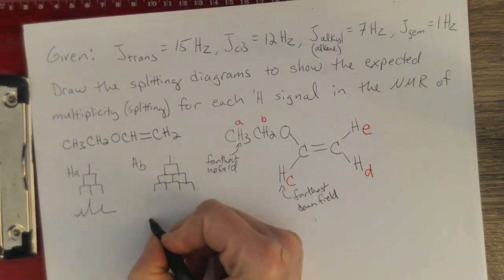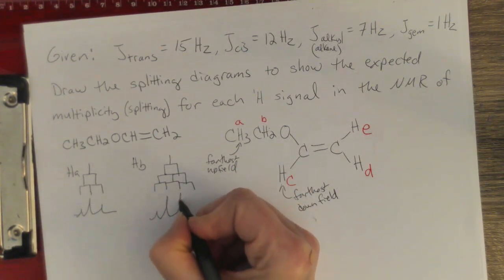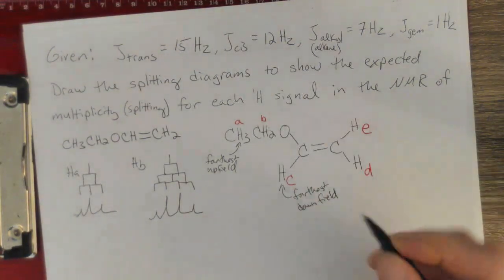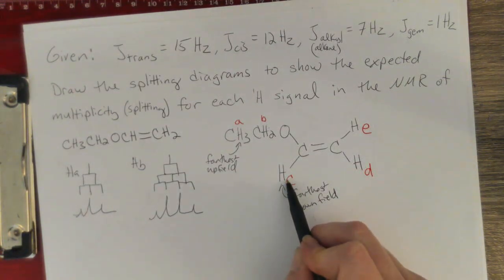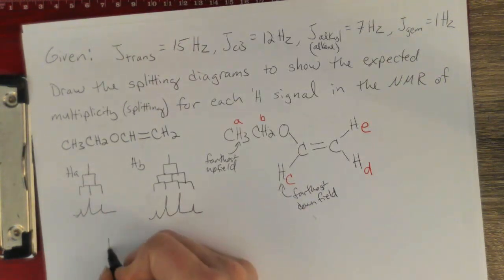Okay, and so here I expect to see that quartet, which is what I would expect with the N plus one rule. Okay, so now let's go ahead and dive into HC. So let's get HC going.